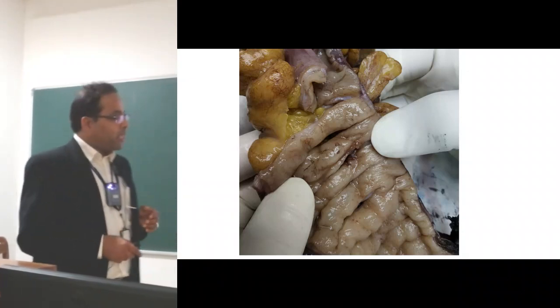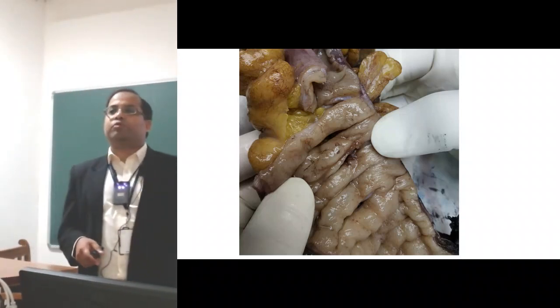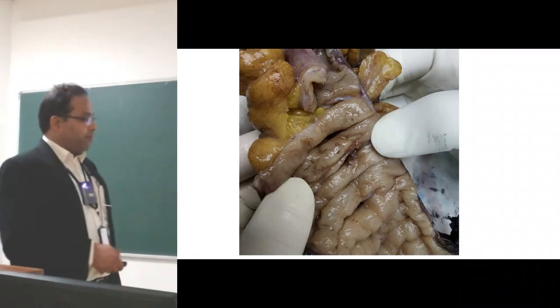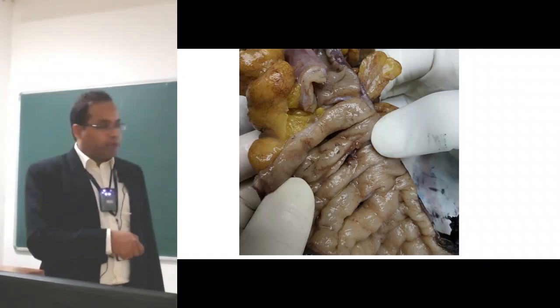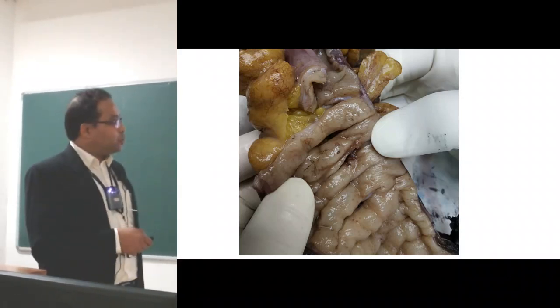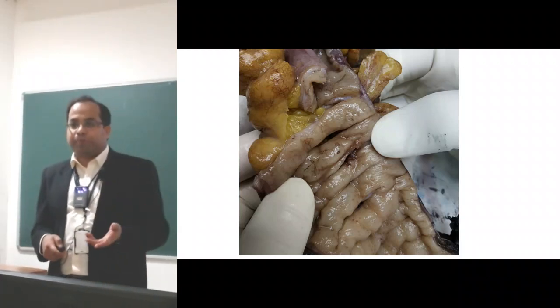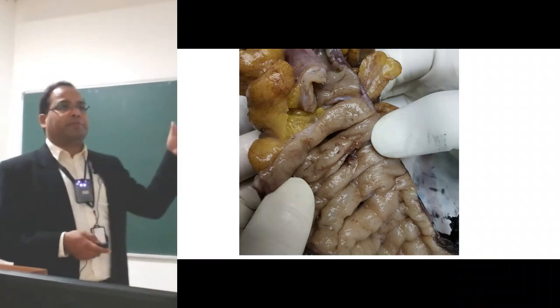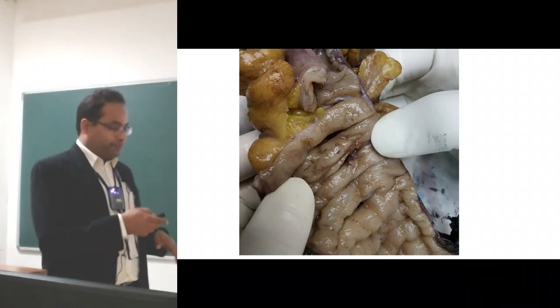manipulation also. So here the radiotherapy has wiped out most of the tumor, as we cannot see a tumor here. This is just edematous colonic mucosa. In a case like this, we have to embed the entire tissue from here to here and find out any microscopic evidence of tumor. This is where the pathologist's work actually starts, starting with grossing of the tumor.